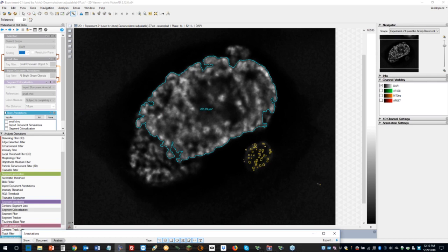So I would say yes, it just depends on the images. In the simplest case, it may be that in some optical sections you have a problem, in other optical sections you do not, and you might just simply want to focus on the optical sections where you don't have the problem, and that way you're not misled. But we should have a look together, and we can figure it out.